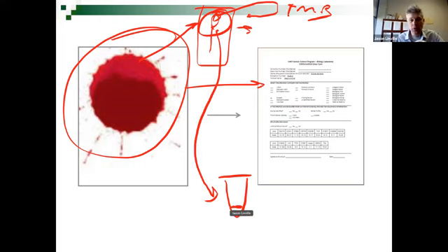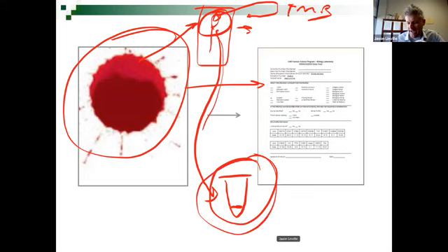And this is where we're at in the course. We've gone through this silica extraction process where we end up with a tube about the size of our thumb. And it just looks like it has a drop of water in it. It's a drop of TE buffer. It is essentially a drop of water, but it has the DNA dissolved in it. So we want to know, how many copies of DNA are we starting off with? In the amplification process, we're going to take a little bit of this DNA, put it in a smaller tube, and then put it in an instrument to amplify the areas of DNA we want to amplify. So that's where we're at in the process.